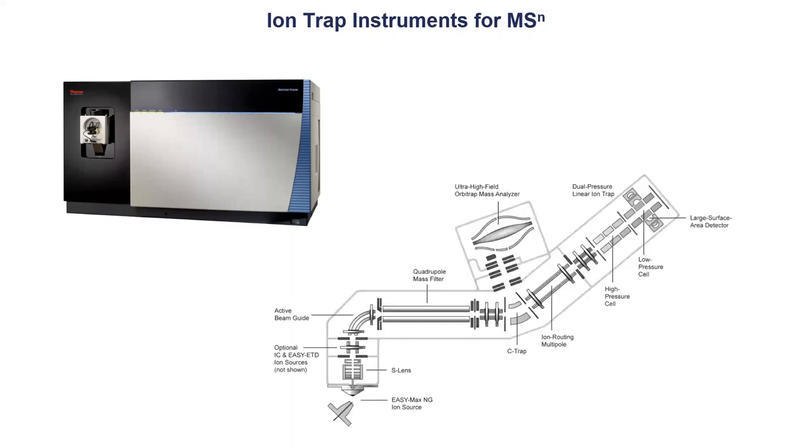But this is something you can address if you have an ion trap. There we can actually do multi-step fragmentation, so we don't stay only on MS2. We have the MS1 scan, we search for the highest signal maybe, we fragment it, but then we can do the same again. We can use the highest signal in the MS2 scan and fragment this further and further. Of course, there's a limitation, because each time you fragment, you lose ions, so you lose intensity.